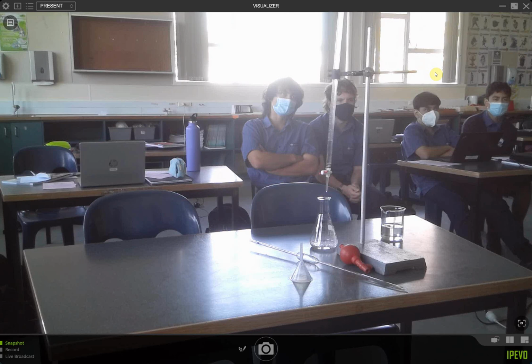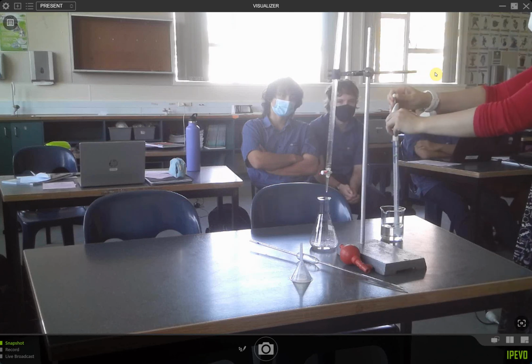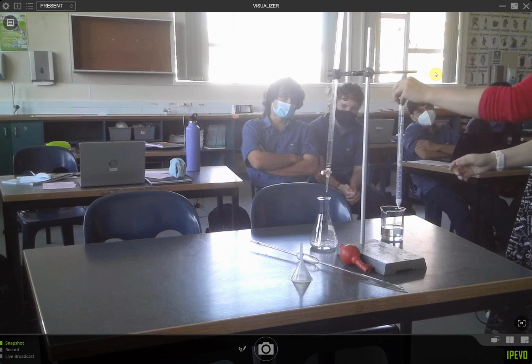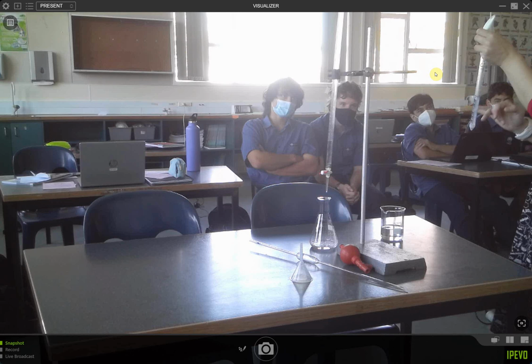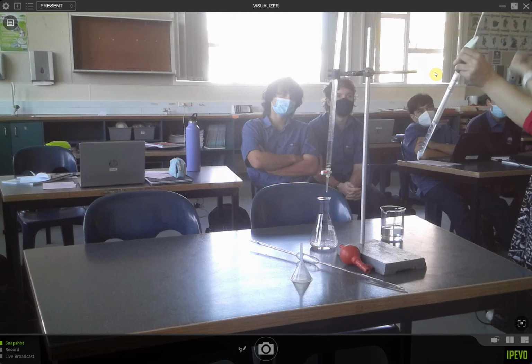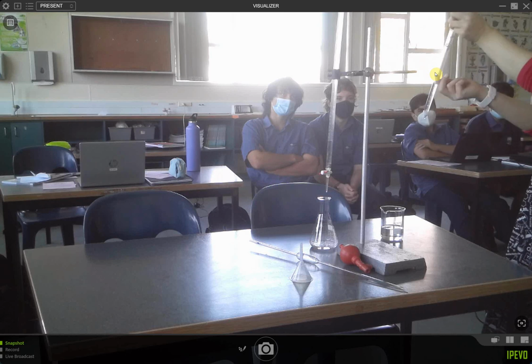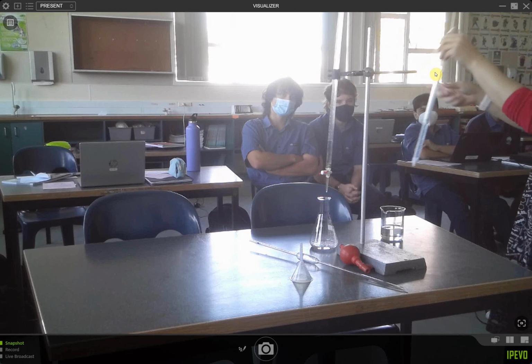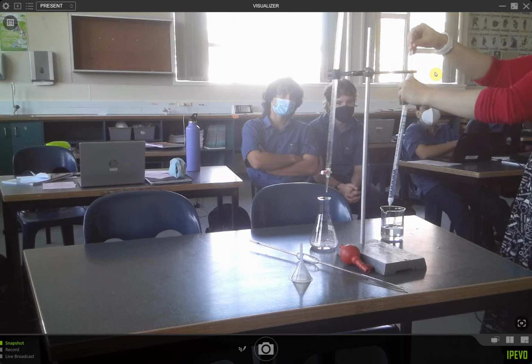If I wanted to get 25 milliliters, I could put this in, and this one works by suction. So you pull it up like that. Some of you might like this one better. The problem with this one is that there's a lot of noise, because you have to think about all the measurements on the side. The good news is it gives you flexibility. If you need 10 mLs, 25, 20, you can do that. But you have to be mindful about where the meniscus is and not read it next to the plunger. That's the downside. Some people like this one. I haven't seen this one before. This is more accurate to what you'll be using in the lab at university, or if you're doing anything science-wise, and then to release it, you just push it back down.